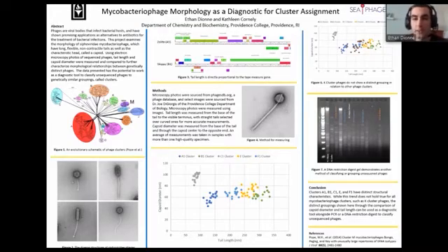So I've labeled this gel to highlight some of these similar patterns in blue, orange, and then one labeled that corresponds pretty well with Skippy, who we sequenced as a B1 phage. So we can use this kind of technique and plot the microscopy photos on a graph after having measured the tail length and capsid diameter to build evidence to make a cluster assignment, along with other techniques such as PCR as well.